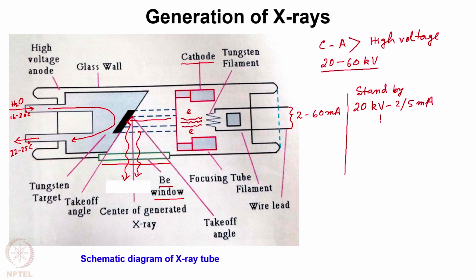But when we try to collect data, we increase the voltage to 50 kilovolt, current to about 40 milliamps, resulting in a power of 2 kilowatt. This amount of energy is then used to generate high intensity X-rays for X-ray diffraction experiments. This is true for both single crystal and powder X-ray diffraction methods, depending on what kind of X-ray tube we are using, copper or molybdenum.